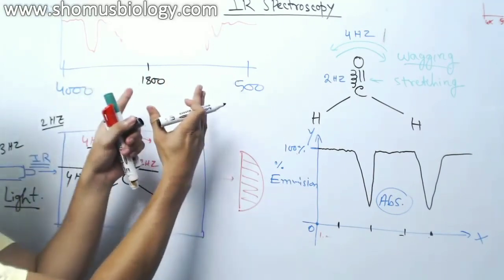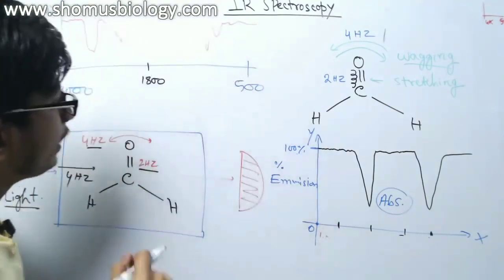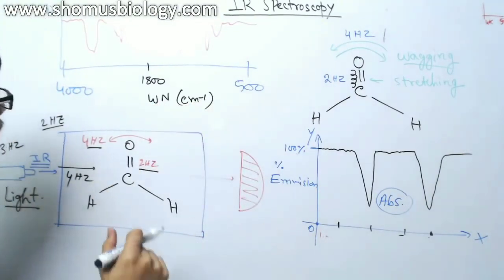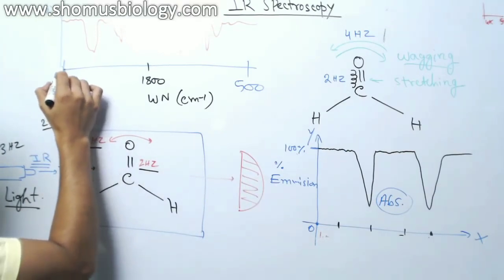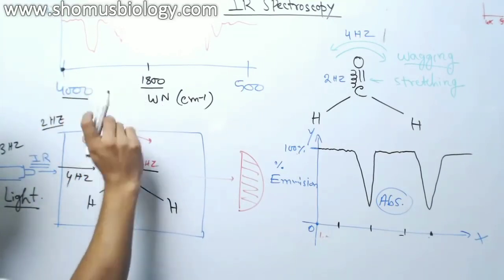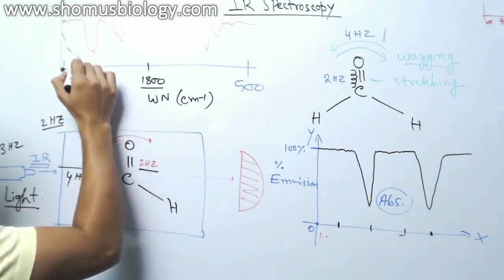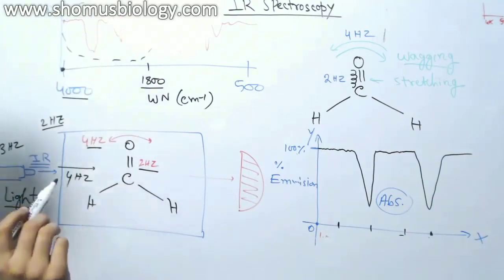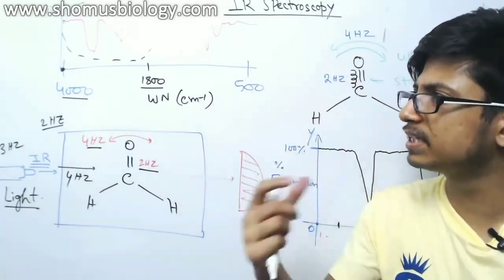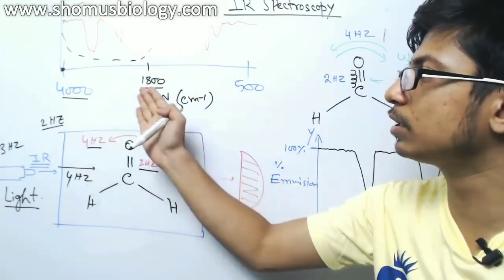There are two segments you can form by looking at any of this IR spectra data. It is completely based on the wave number that we are looking at. It starts from 4000 to 1800, that range, and then another range from 1800 to 500. Mostly from 4000 to 1800, that area of the data represents the functional groups. Mostly it represents all the specific basic functional groups that we know of in organic chemistry. All those functional groups range from 4000 to 1800.